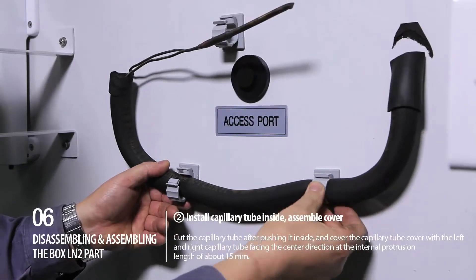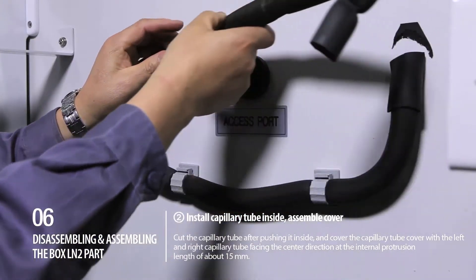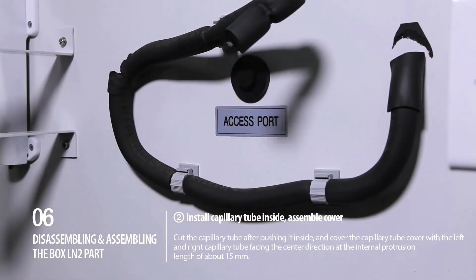Step 2: Install capillary tube inside, then assemble the cover. Cut the capillary tube after pushing it inside, and cover the capillary tube cover with the left and right capillary tube facing the center direction at the internal protrusion length of about 15mm.